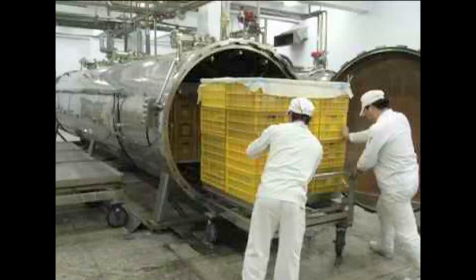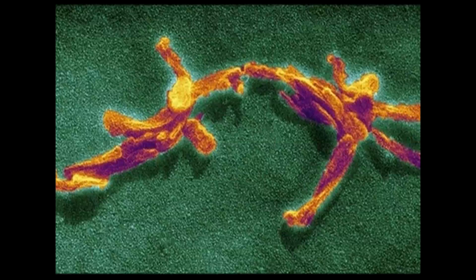But as we all know, every process has certain limitations, right? Similar is the case with the autoclave. We can see that the autoclave is unable to kill prions, right? Another limitation is that as moist heat is the principle for killing of microorganisms, this moist heat sometimes leads to deposition of rust on certain metallic surgical instruments. That's why we have certain limitations in its usage.